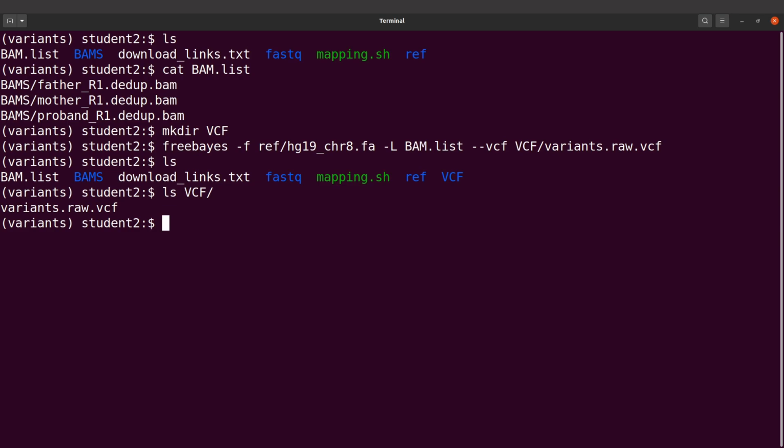Now, if you're interested to learn how to use other tools like BCFtools to generate VCF files, so let me just say to call variants, then you can check the videos in this playlist.